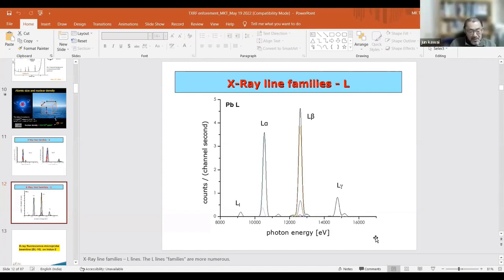It is simply a spectrum of a bulk sample. It is not particle size, and it is not total reflection. It is neither related to total reflection nor to flows. I just want to show how much complexity there is while you do the analysis.